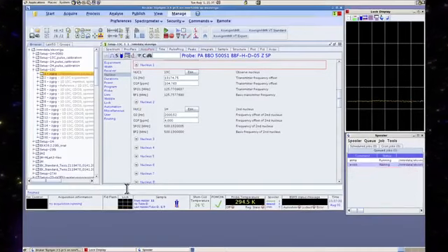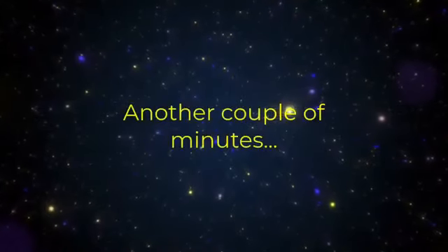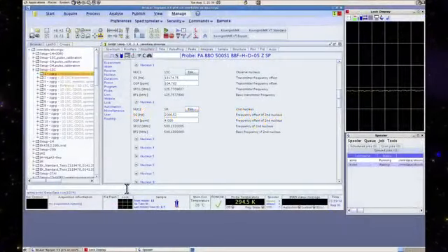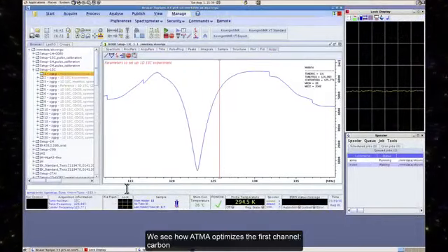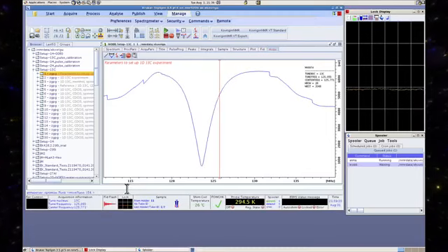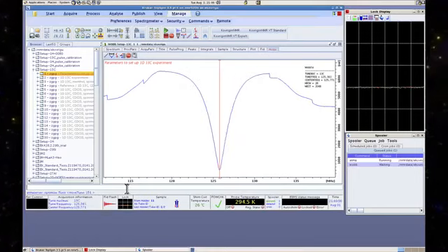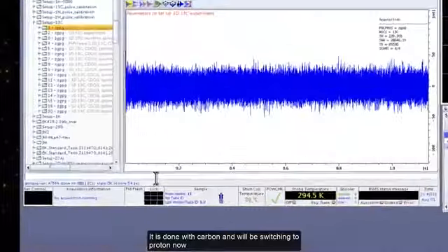2.1 System architecture, console, magnet, and workstation. The Bruker AV III system is a fully integrated instrument comprising 3 main physical units that work in concert. 1. The magnet, function, provides the strong, stable, and homogeneous static magnetic field, B0, which is the foundational requirement for NMR. Location, typically housed in a separate room or shielded area due to its strong stray field and sensitivity to environmental disturbances. Key feature, houses the probe head and sample within its bore.